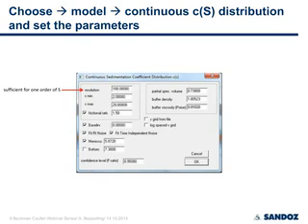If you want to focus on the smaller aggregates or degradation products, you may lower the speed and analyze a different set of S values, but I prefer for the usual 150 kilodalton monomer antibody and its dimer, trimer, tetramer up to, let's say, 2 megadalton to set the range from 2S to 20S.